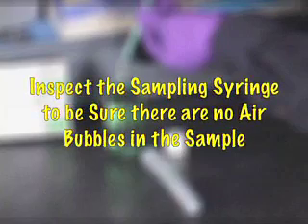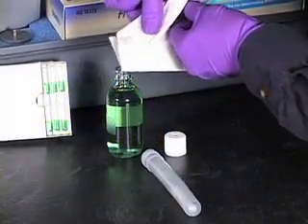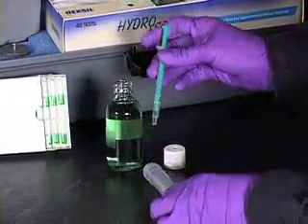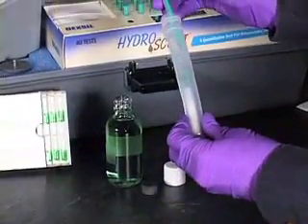With the paper wipes provided, wipe the excess oil off the syringe. Insert the syringe into the reaction tube and depress the plunger, emptying the oil into the tube.